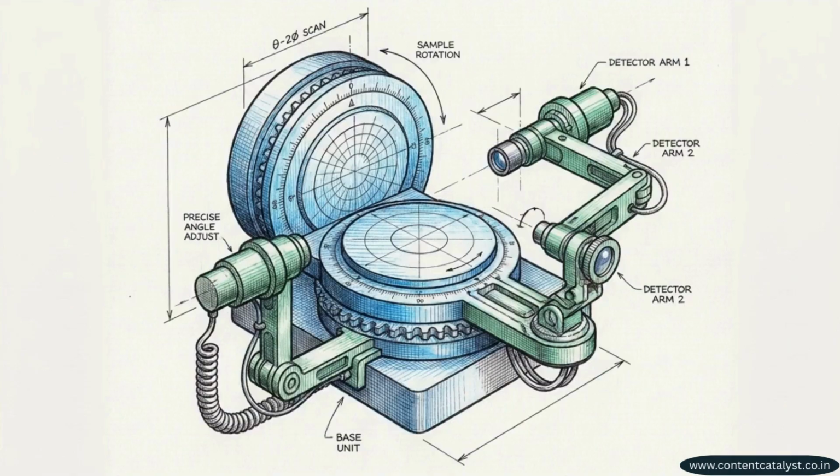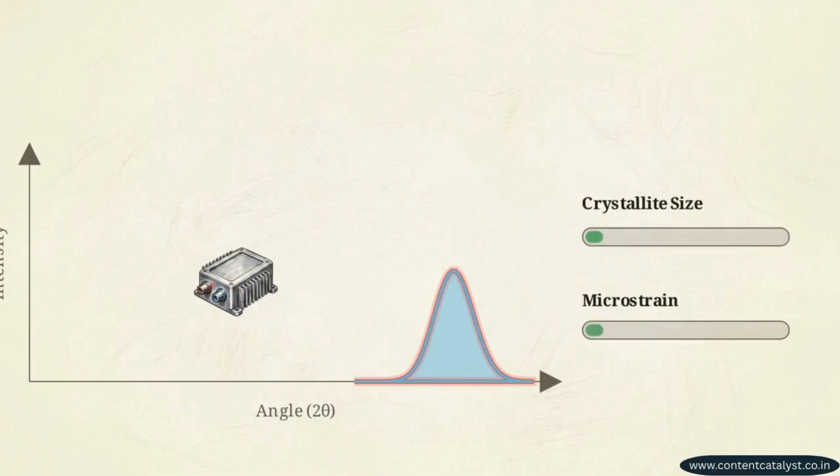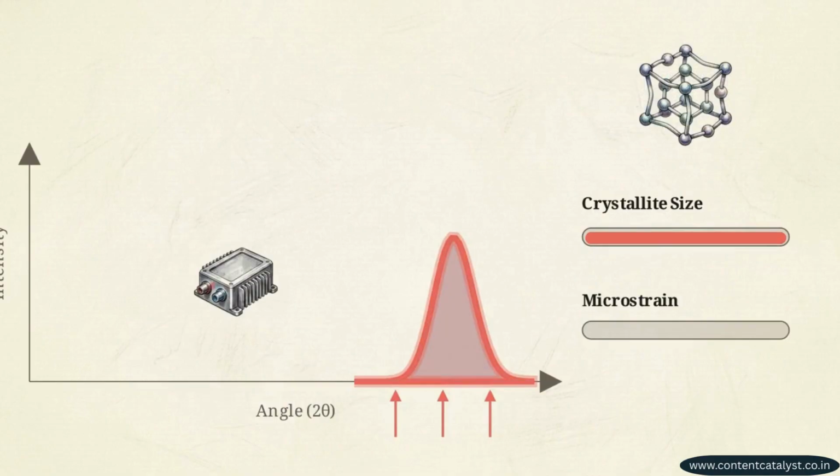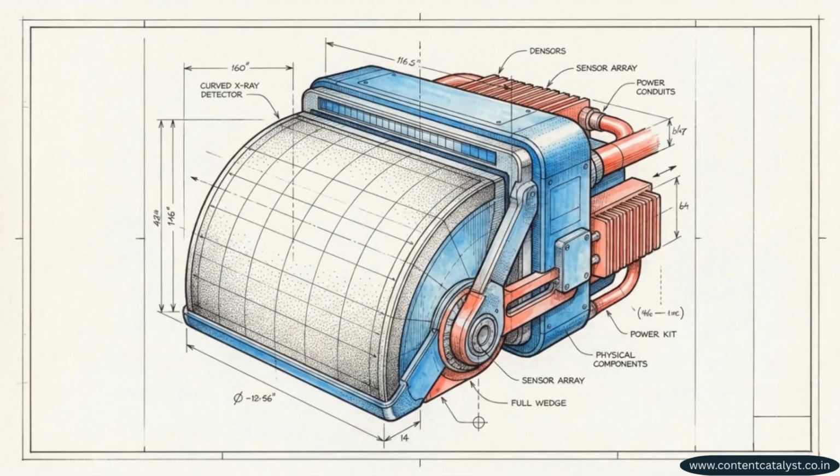Every diffractometer inherently distorts the incoming signal. A mathematically perfect, sharp reflection emerges on the screen as a broadened, asymmetrical curve. Without an accurate instrument geometry model, the math breaks down, forcing sample parameters to artificially absorb the difference in crystallite size or microstrain. The primary defense against this error is the BGMN-based instrument configurator built into Profex. The 5.7.1 update refines this further by introducing a new detector model option, allowing for an even more precise geometric description of modern lab hardware.